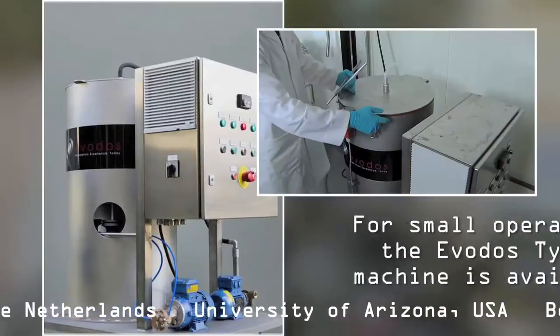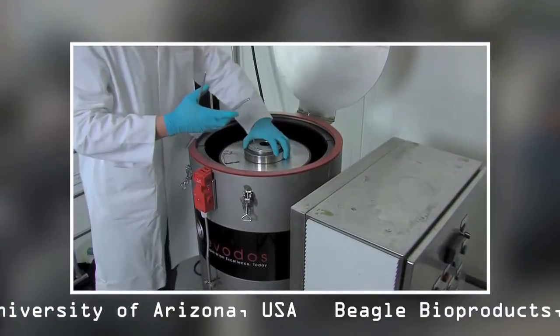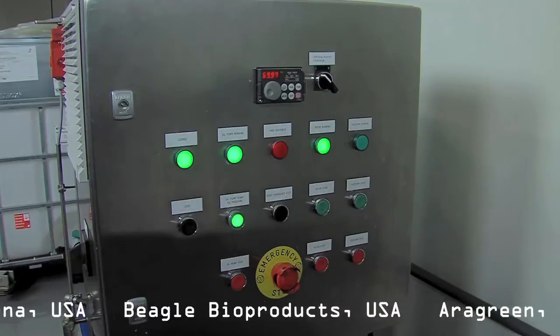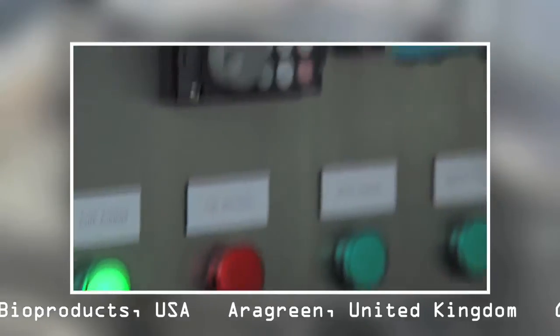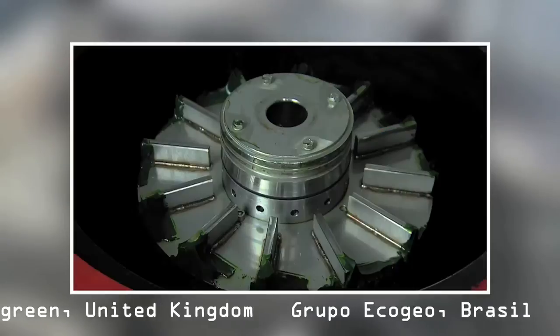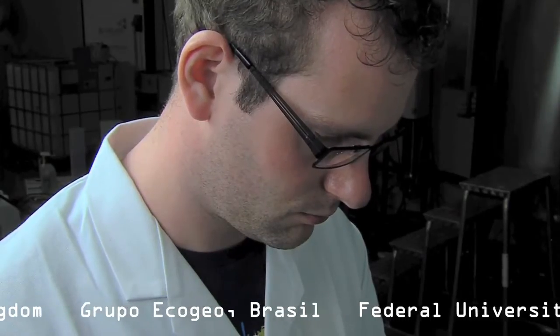Although it is only on the market for a couple of months, it already is a big hit amongst universities, research centres and starting algae operations. With a capacity of 750 litres per hour, the Type 10 is the Evodos entry model. It is designed to harvest a high quality algae paste in limited volumes.